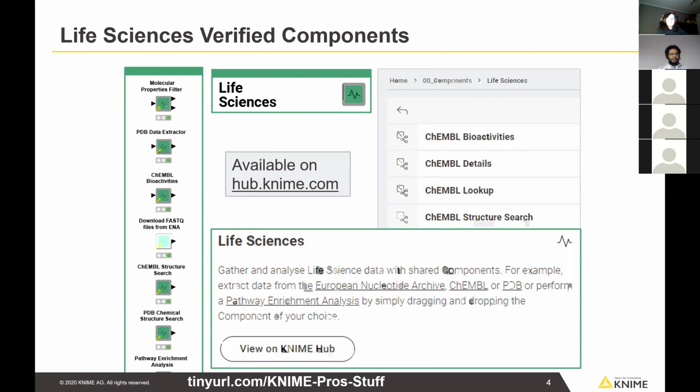Here is some stuff about life science related verified components. We have a lot of components developed in the past year, and we have our own category for life sciences. These are chemistry, chemoinformatics related components, bioinformatics related components.